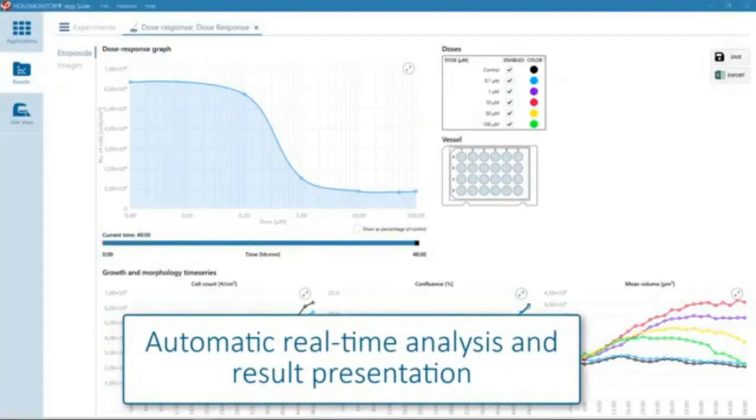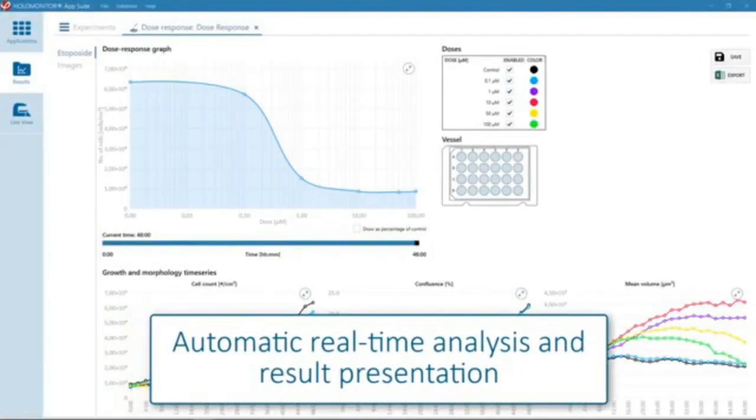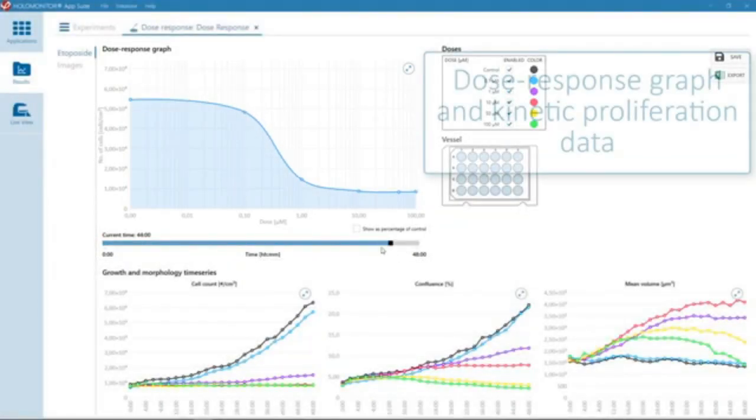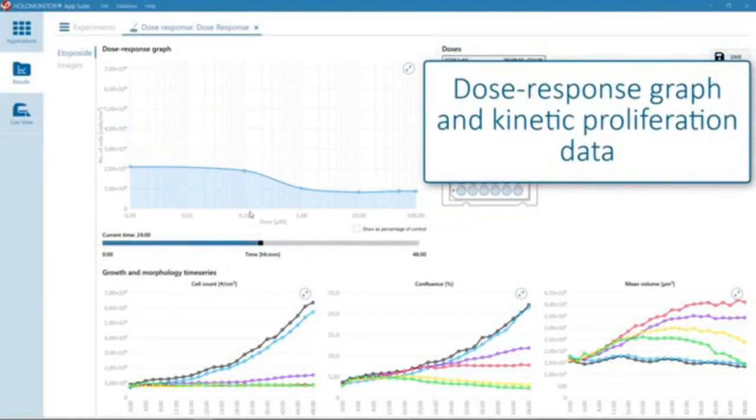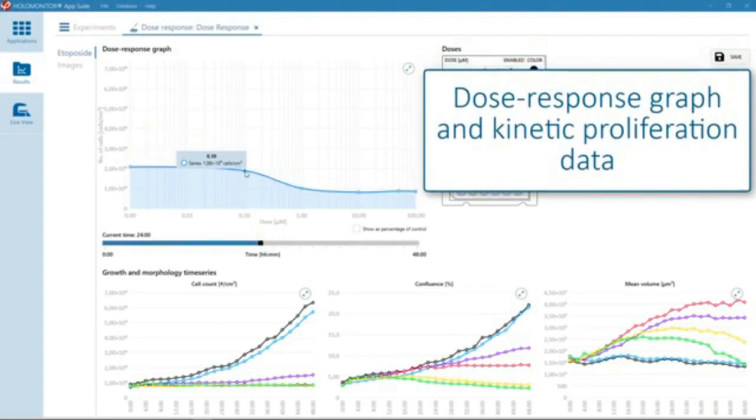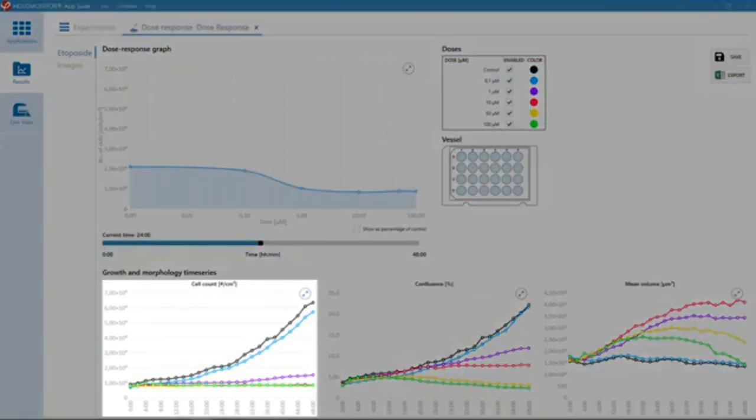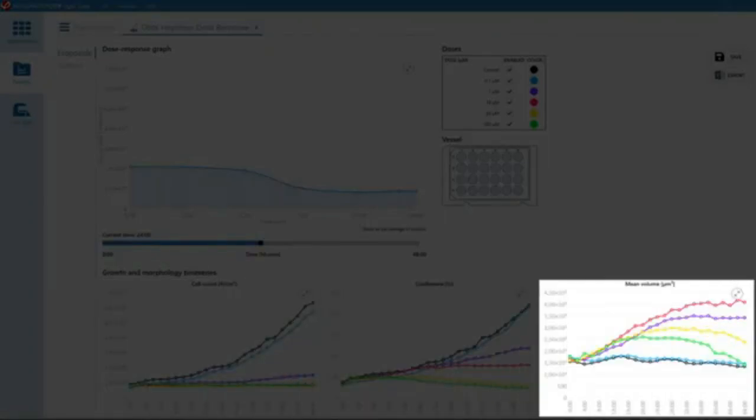The analysis is done automatically, and the results can be viewed in real time, like here, where you can see dose response graphs from any selected time point. You will also get kinetic proliferation data presented in graphs showing changes in cell number, confluence, and cell volume over time.